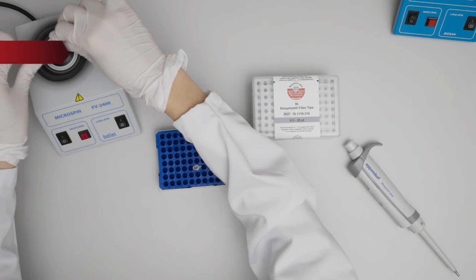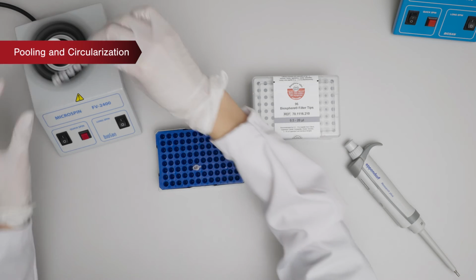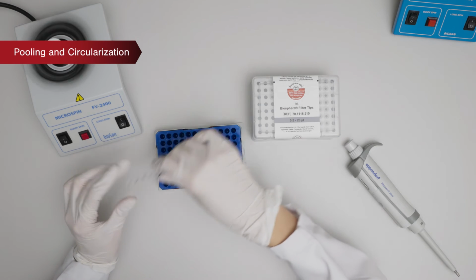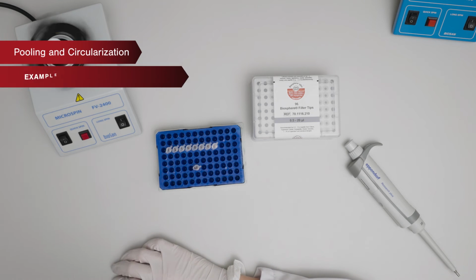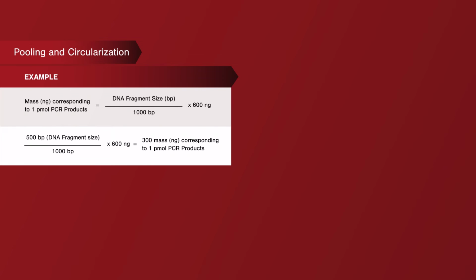Depending on the concentration of each sample, the samples that are intended to be sequenced on one lane are pooled together so that the total amount of DNA on one lane reaches 1 picomole and does not exceed 48 microliters. Let's say we are going to sequence only one sample per one lane.